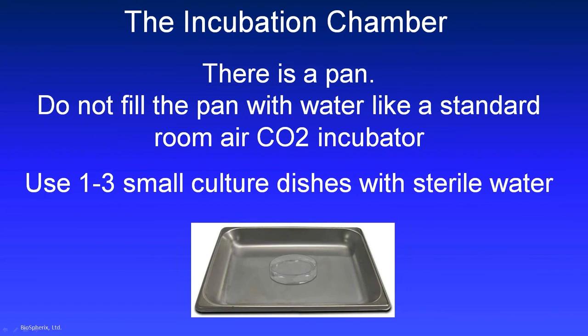Now, there is a pan that's provided with each incubator, and this looks like the type of pan in a traditional room air CO2 incubator that you would fill with water. But I'm telling you, do not fill this pan with water like you do in that standard incubator. What you want to do is take a little dish and fill that with sterile water and see how long that little dish lasts you. If you need a second dish, add a second dish. Depending upon the conditions in your incubator, that may be all the water you need. You really don't need to fill that whole pan full, and there's lots of good reasons not to, and we'll go through that in a later unit.